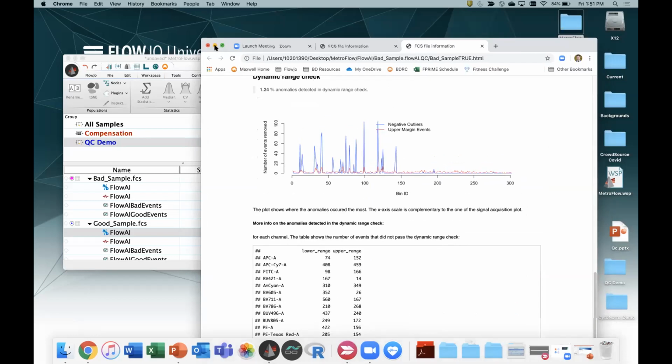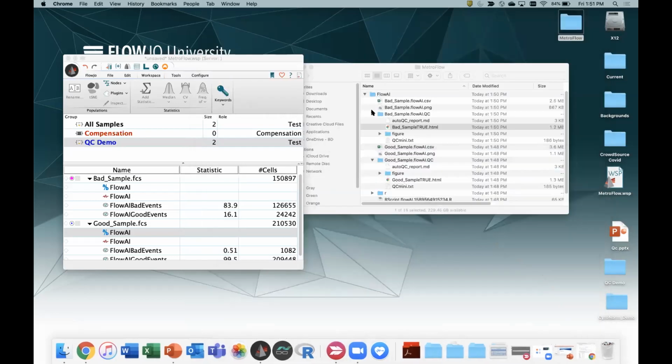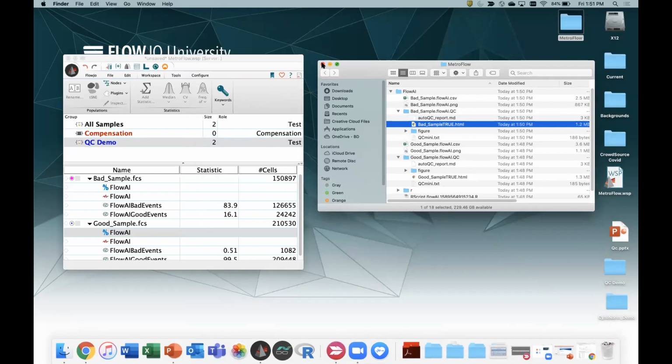All right, I'm going to move right into CytoNorm. We have about 4 minutes here or so, so let's just do it.